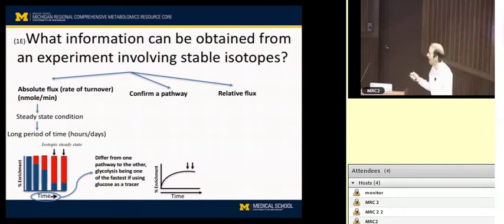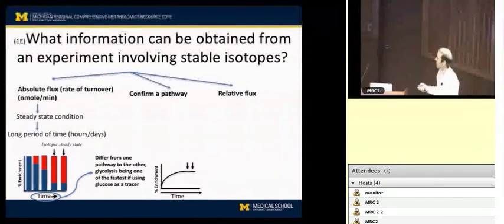And this is not how we focus on delivering data for most of our clients, although we have had core lab customers who are interested in doing this and will take data generated by the Metabolomics core and using their own resources and or other collaborations have attempted to do this sort of modeling. Okay, so this is out here on the percent enrichment. We're way out here on the later in the time axis.